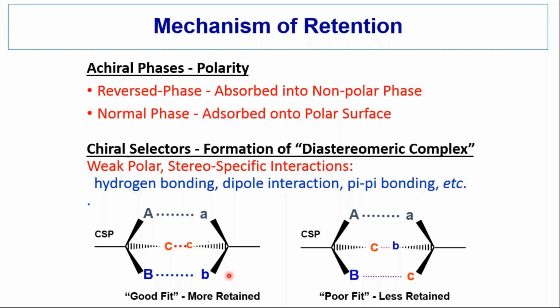With this good fit can sometimes come at a price. We have more interactions. Think about in achiral reverse phase chromatography, we deal with the dreaded secondary interactions, such as the interaction of amines with silanols. We try to disrupt that secondary interaction. Here, we don't have secondary interactions, we have tertiary interactions at a minimum. Sometimes we have quaternary or higher levels of interaction. We have 4, 5, 6 chiral sites that may interact with the isomers. We need at least 3, but we sometimes have more. So there's always a possibility of having, say, a sluggish off rate with one of these interactions.